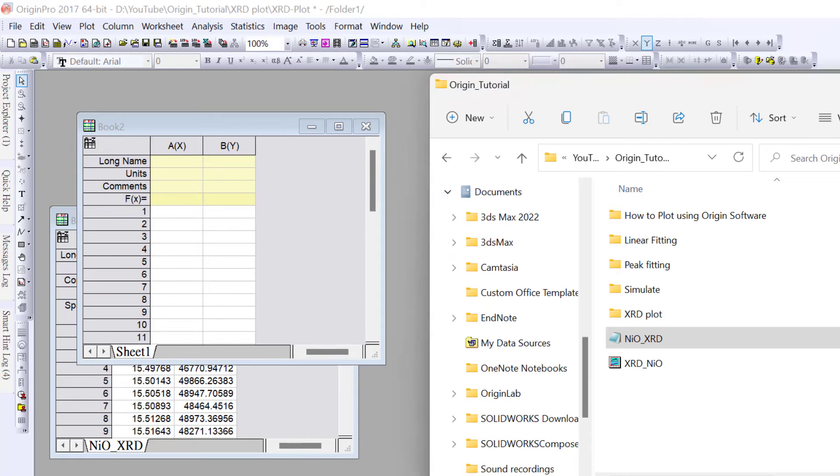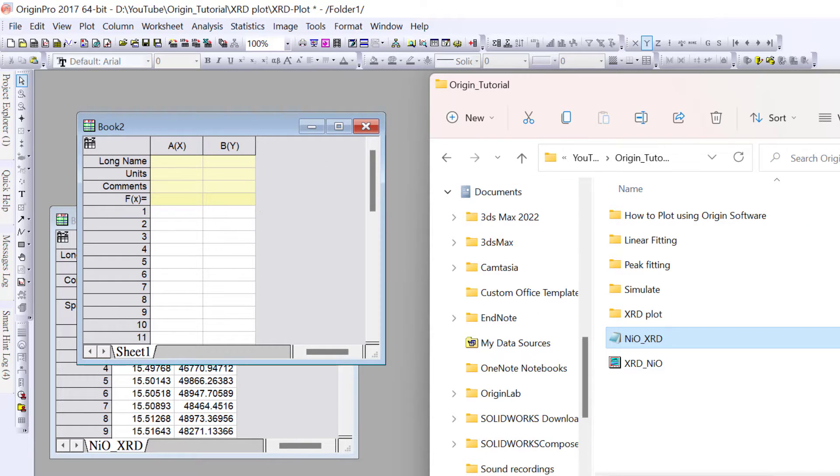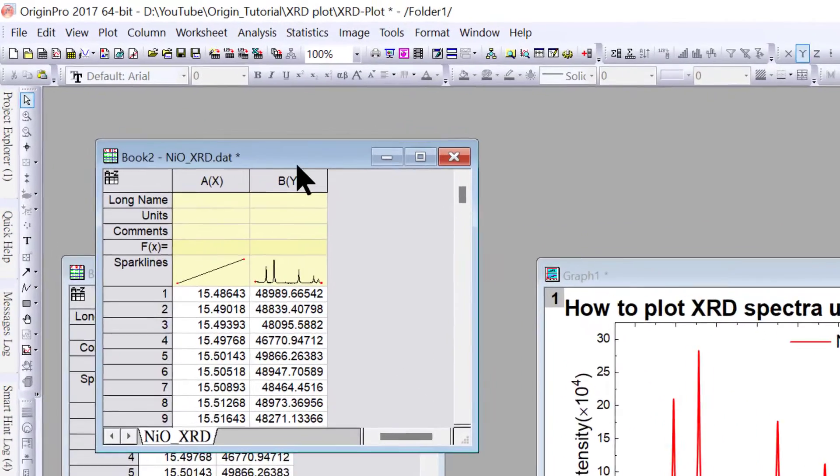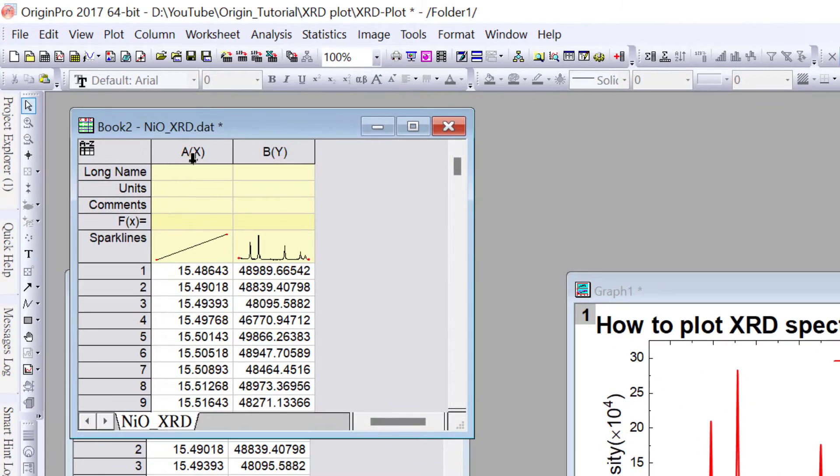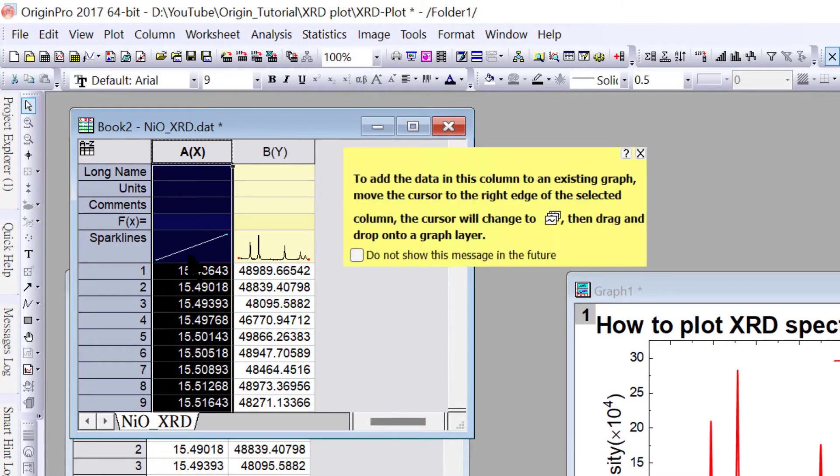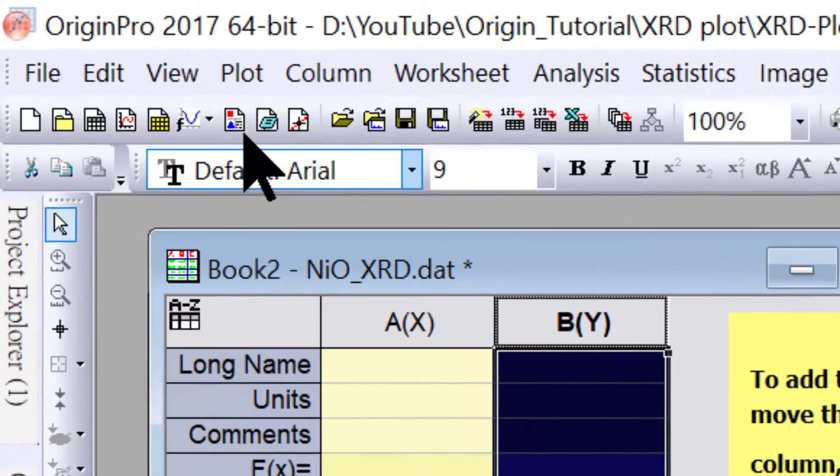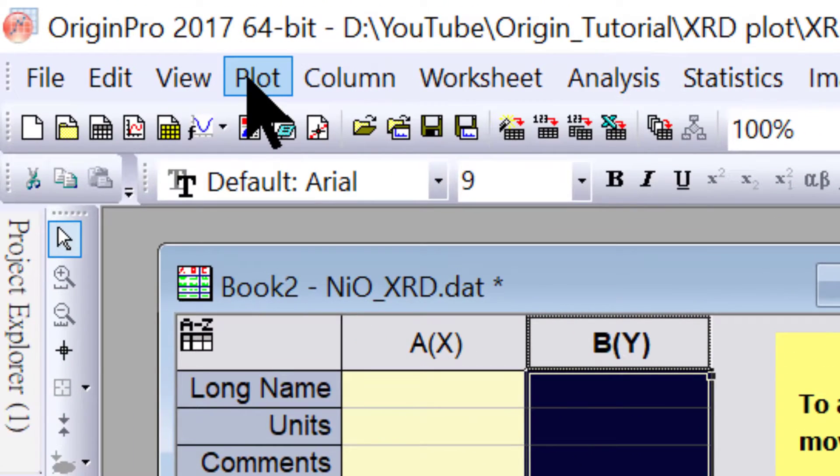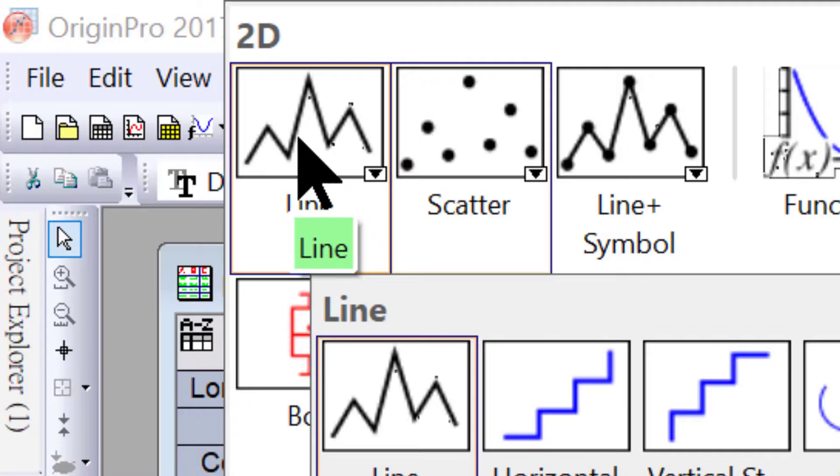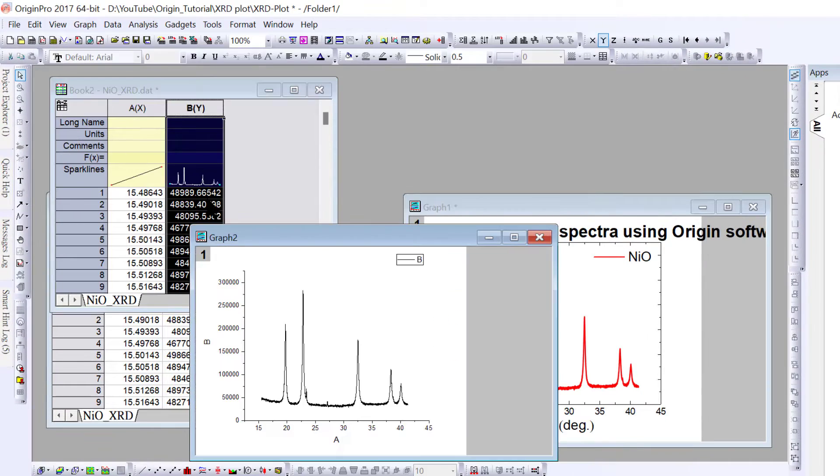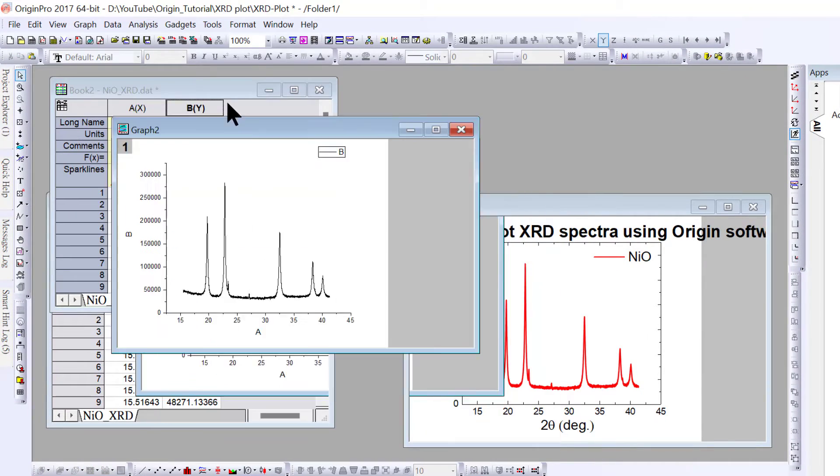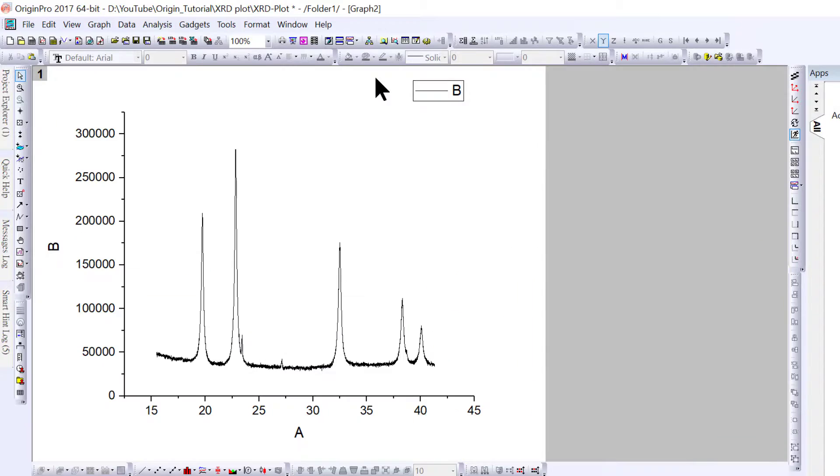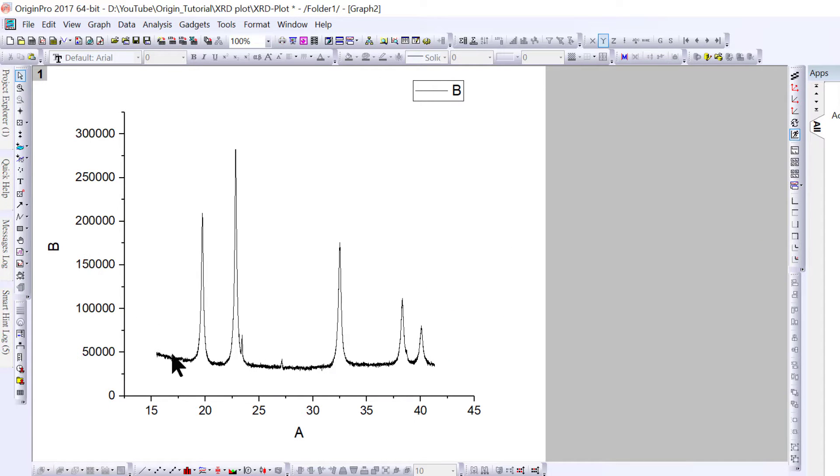Drag your XRD data file. Here the x-axis is 2 theta and the y-axis is intensity. Select the y-axis, then go to the plot menu, select line plot, and click. It will plot the XRD spectra. You can see the x-axis shows A and the y-axis shows B.